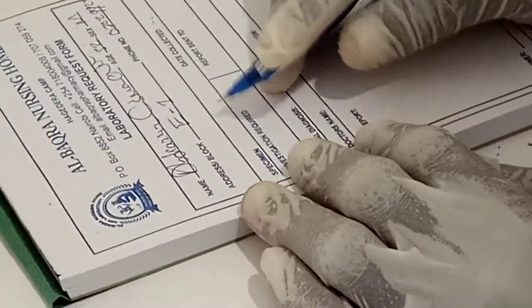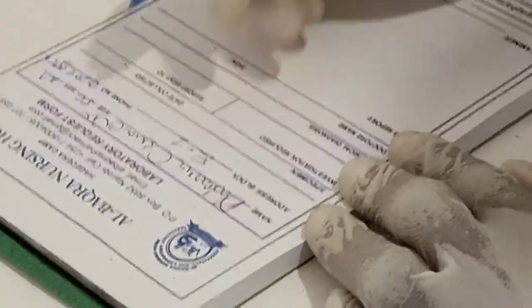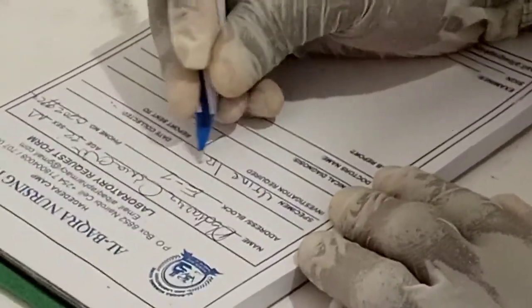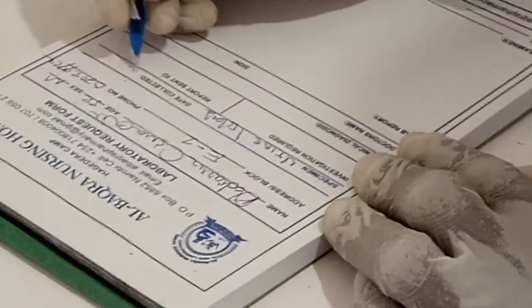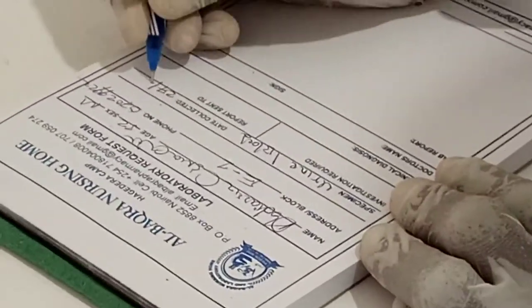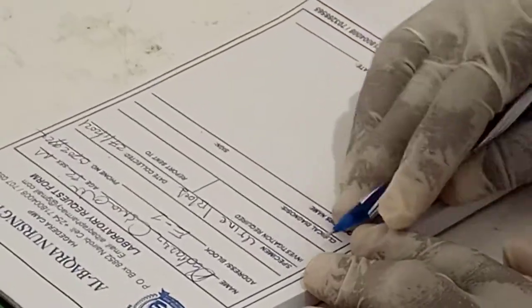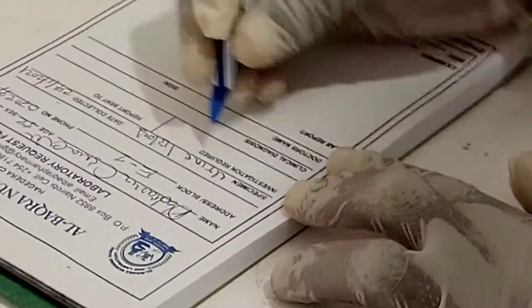Here is the specimen that you are going to investigate, whether it is blood or stool or urine, like urine and blood. So here is the date collected, 27/1/2021. Also here is the investigation of the urine or blood.